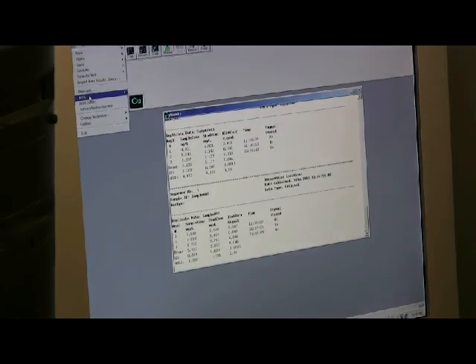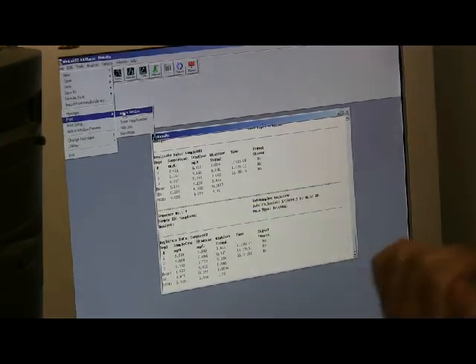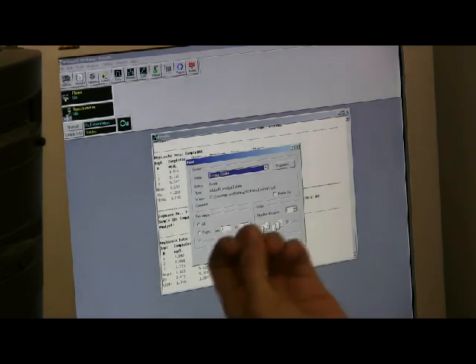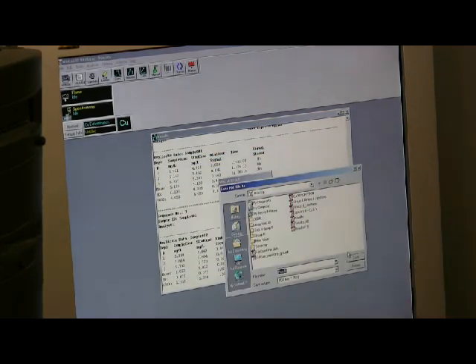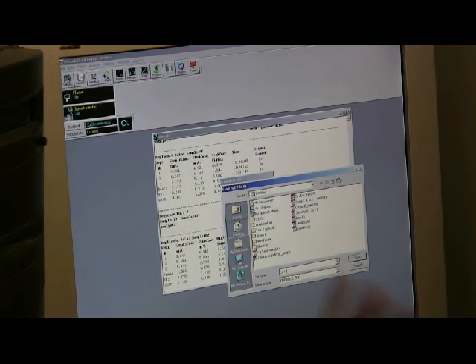So these are my results. Click on File, Print, Active window, since this is your active window, and just okay, and I can save it however you guys prefer.